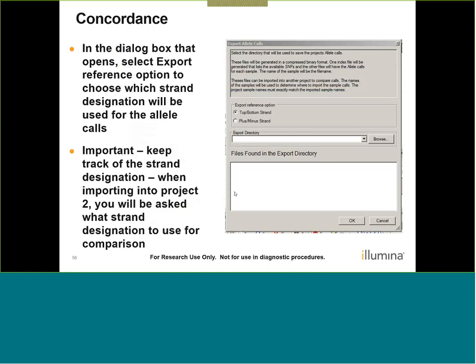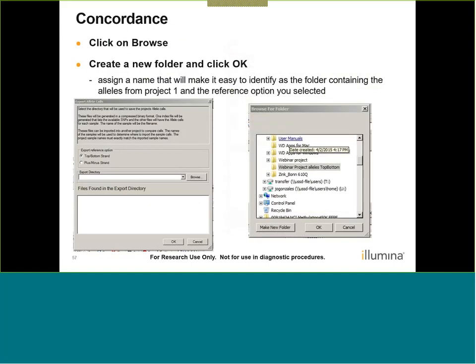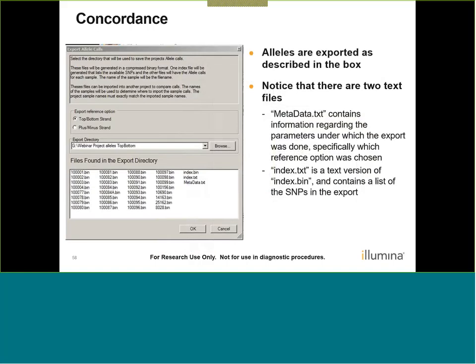So next, you'll browse and create a new folder to put these export files in and select a name that will allow you to keep track of this folder very easily. And then once you export it, these files will be created in the directory.